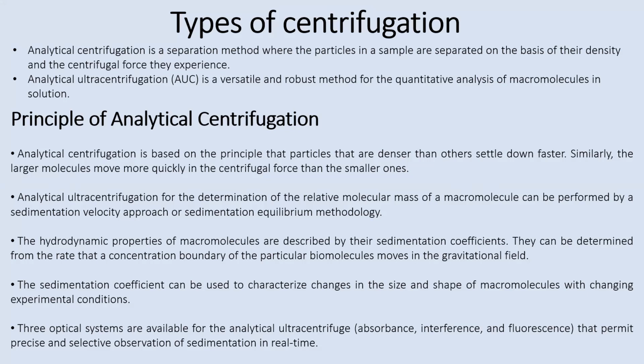So basically, when you want to do a quantitative analysis of the macromolecule in solution, you're going to use the analytical centrifugation approach. Okay. Now, the sedimentation coefficient will depend on a lot of things. It will depend on the size and on the shape of the macromolecule, with changing experimental conditions. So the size and the shape of the macromolecule are also determined by the experimental conditions.